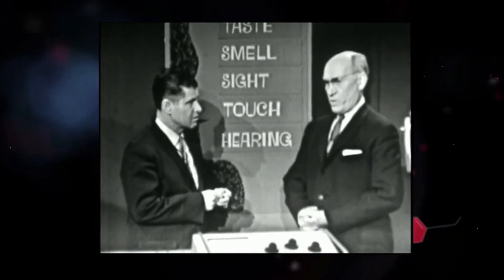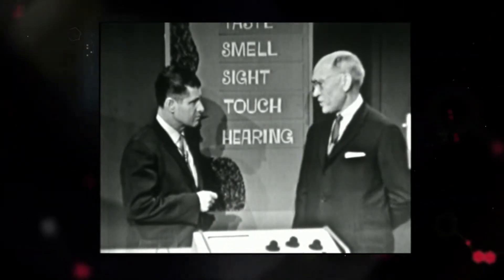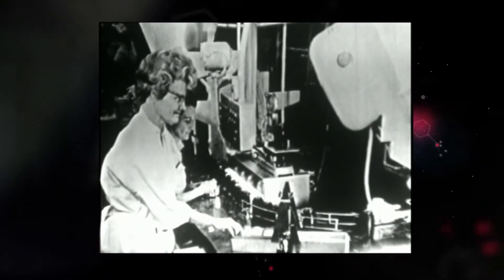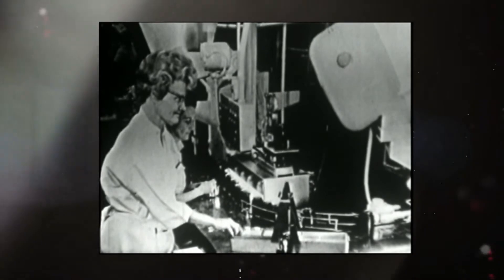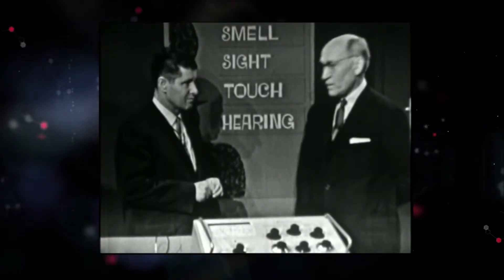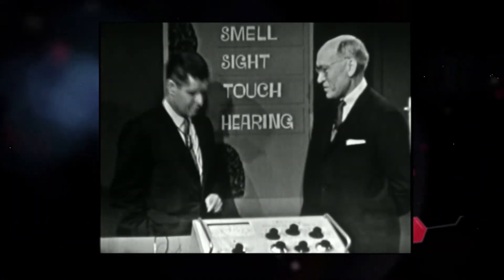Dr. Beckman's pH meter is used anywhere you find water or aqueous solution. In food processing, for example, in making jelly — jelly will simply not gel unless the pH is right. So in the commercial production of jams and jellies, pH is a very important factor that has to be controlled. In swimming pools, and everywhere where there's water, there's a pH measurement that's necessary.